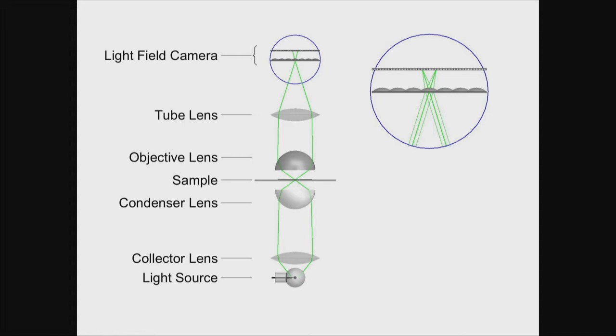But we think for polarized light, you get this additional information about how polarization fared as it went through your sample for different orientations, and that really makes a difference.